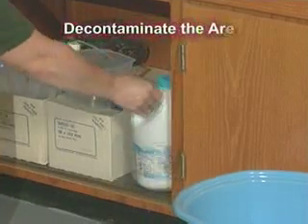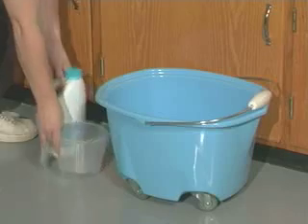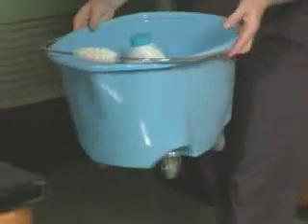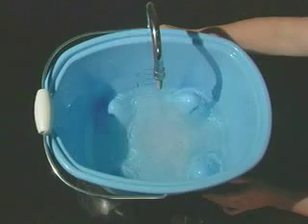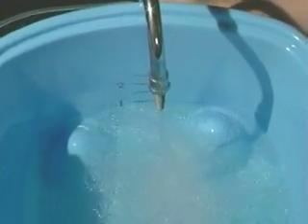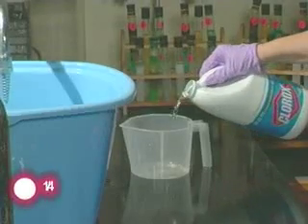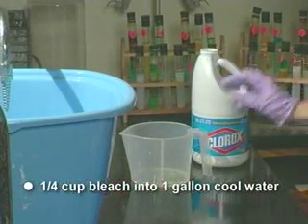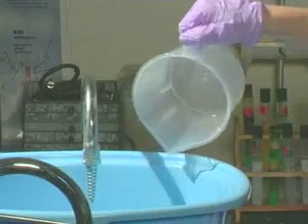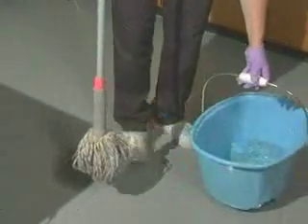To decontaminate the area, apply an appropriate disinfectant, such as a fresh solution of diluted household bleach. Pour one quarter cup of household bleach into one gallon of cool water. The contact time for bleach is generally considered to be the time it takes the product to air dry.